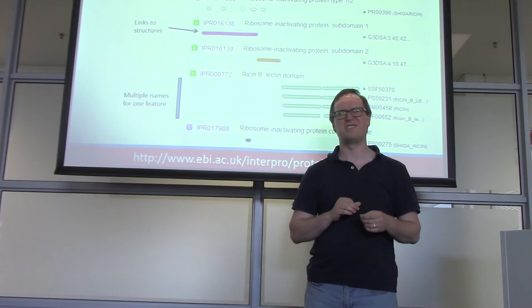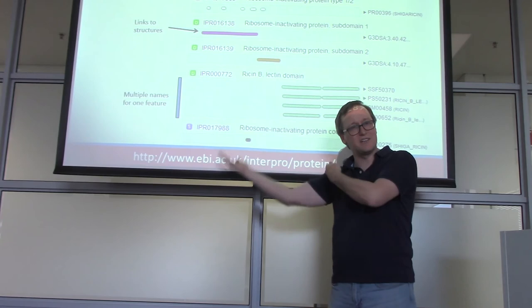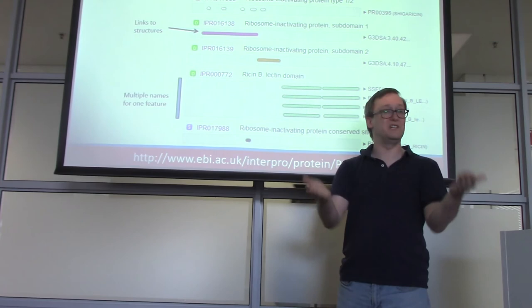Okay, so ricin and me, we have a story. And I like telling that story here because it has this two-part functionality built into the protein sequence, and the signatures that it hits within InterPro reveal that functionality very clearly. If you have some protein sequence and you don't understand which part does what, InterPro is your best friend.